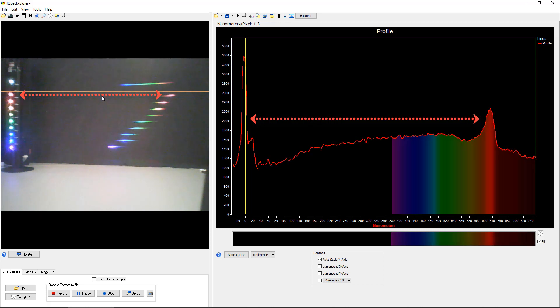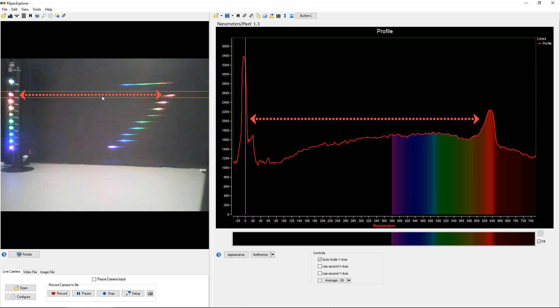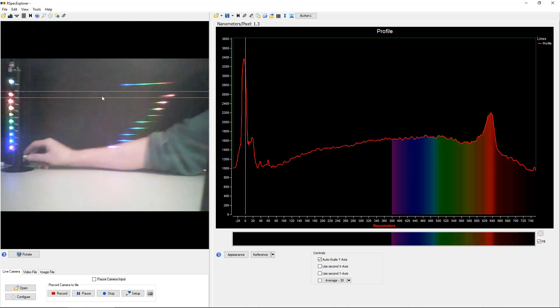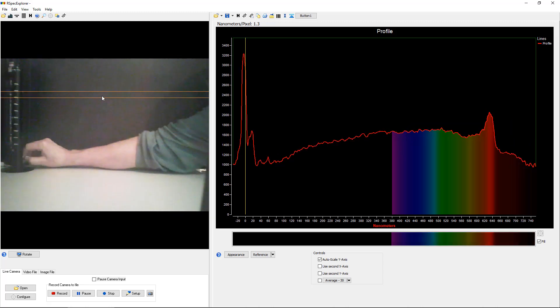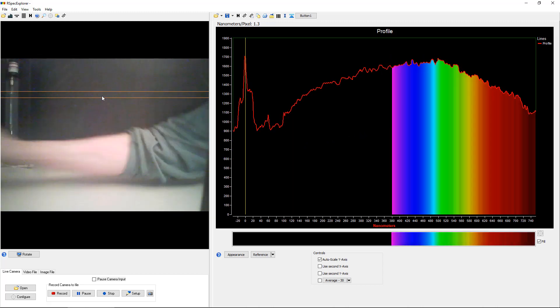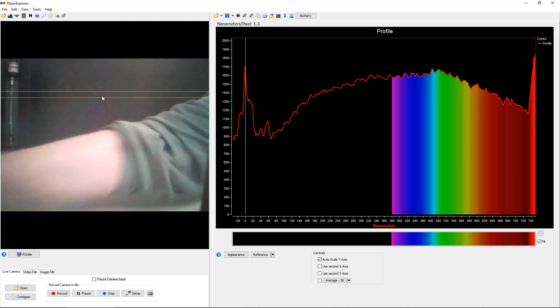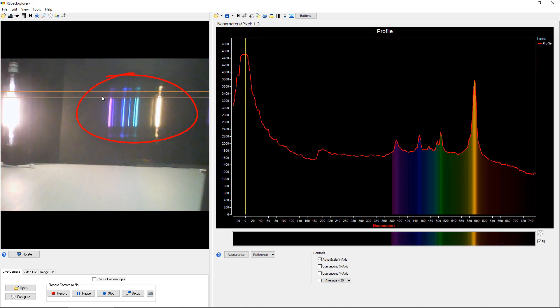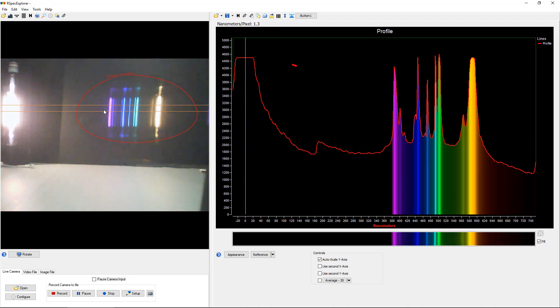So let's get rid of the colorful LED array and turn on our gas tube. Aha, there's a beautiful gas tube spectrum that's so captivating to students.